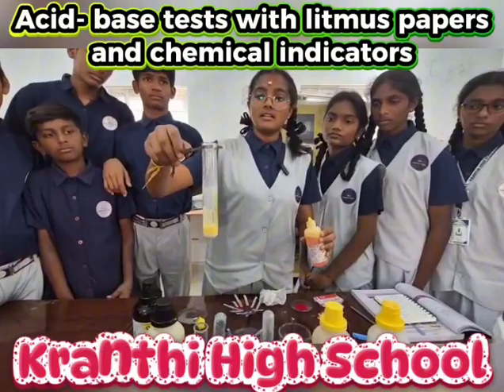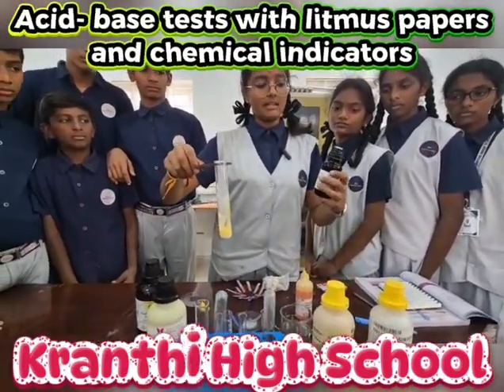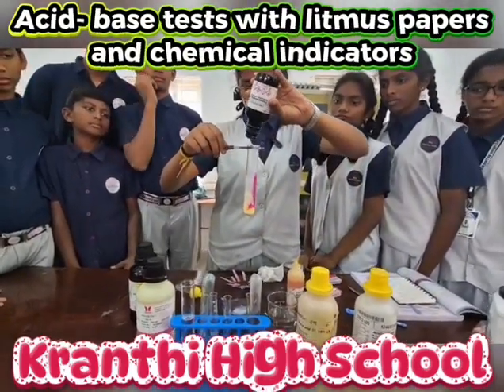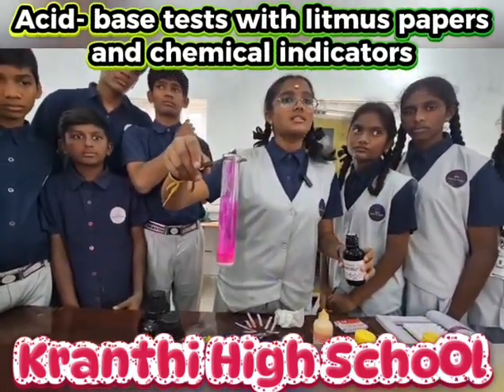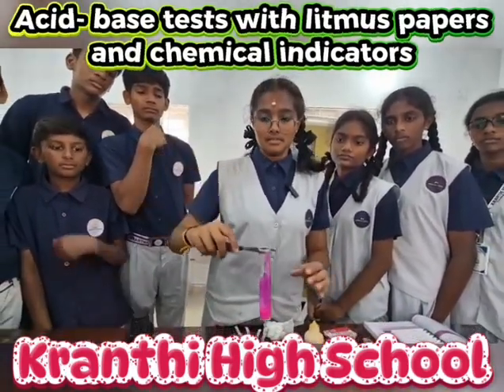the solution has turned into yellow color, and we can also test it with phenolphthalein indicator. As you see, the solution has turned into pink. We can also consider it as a base.